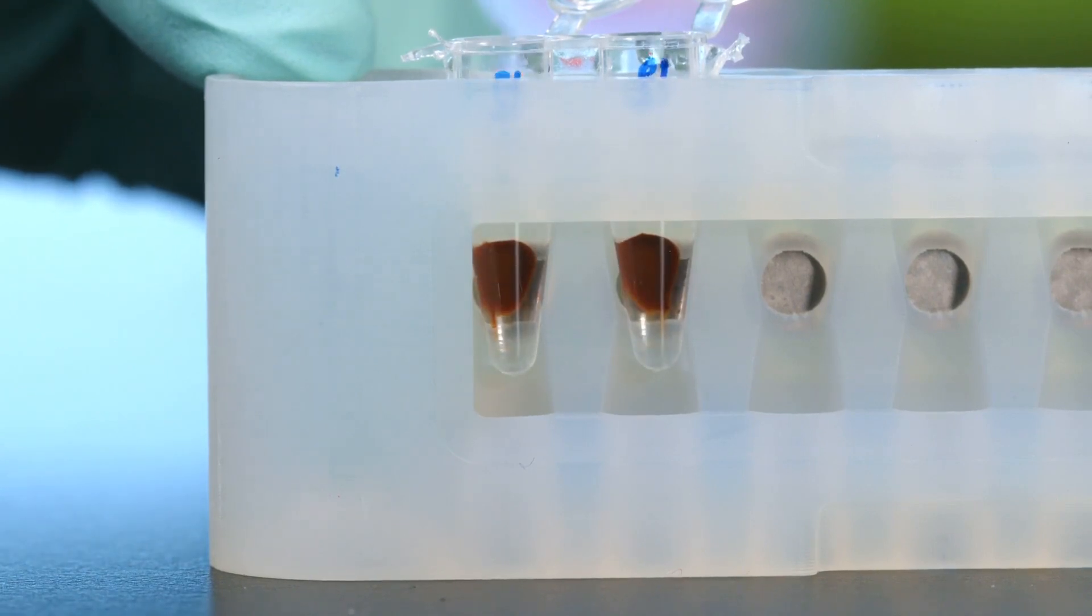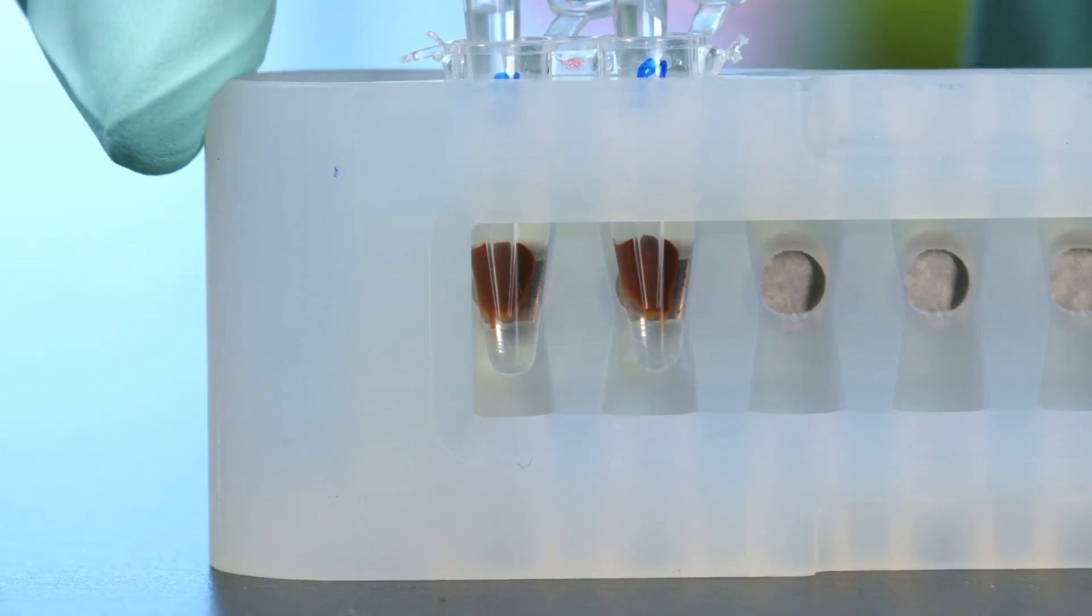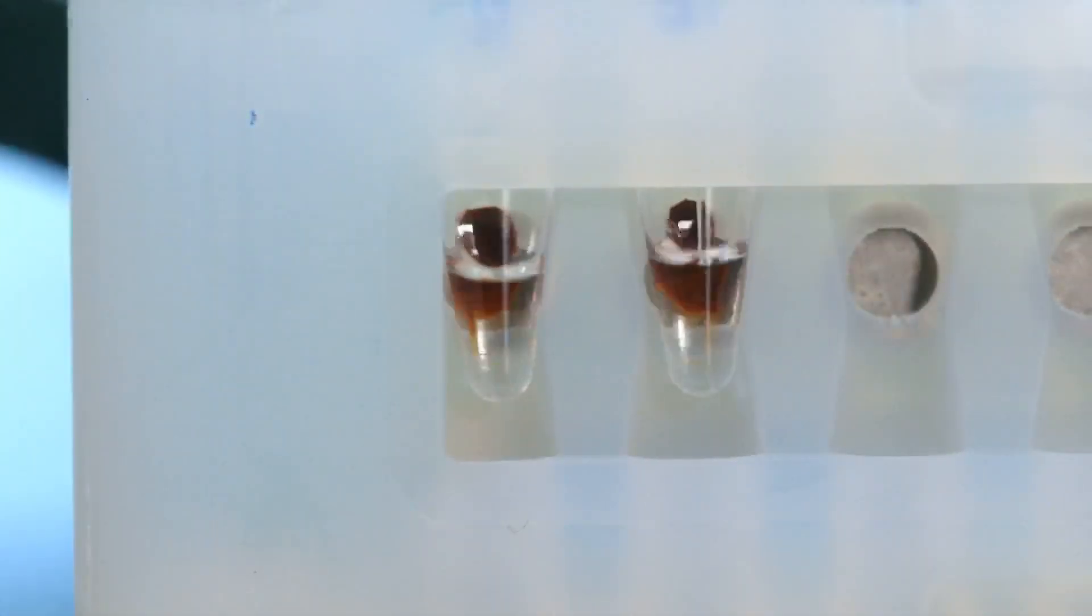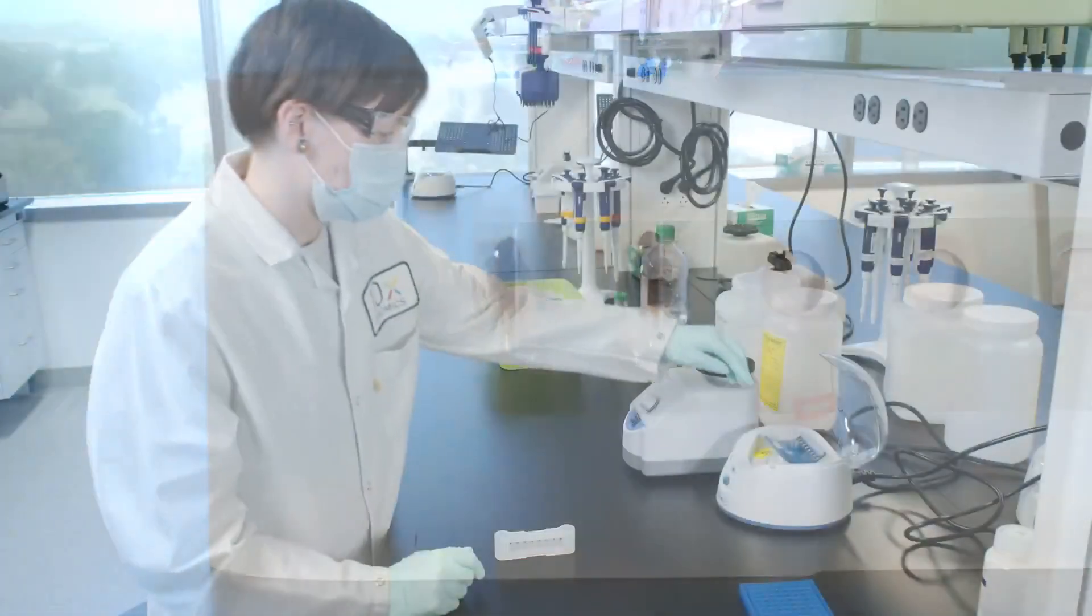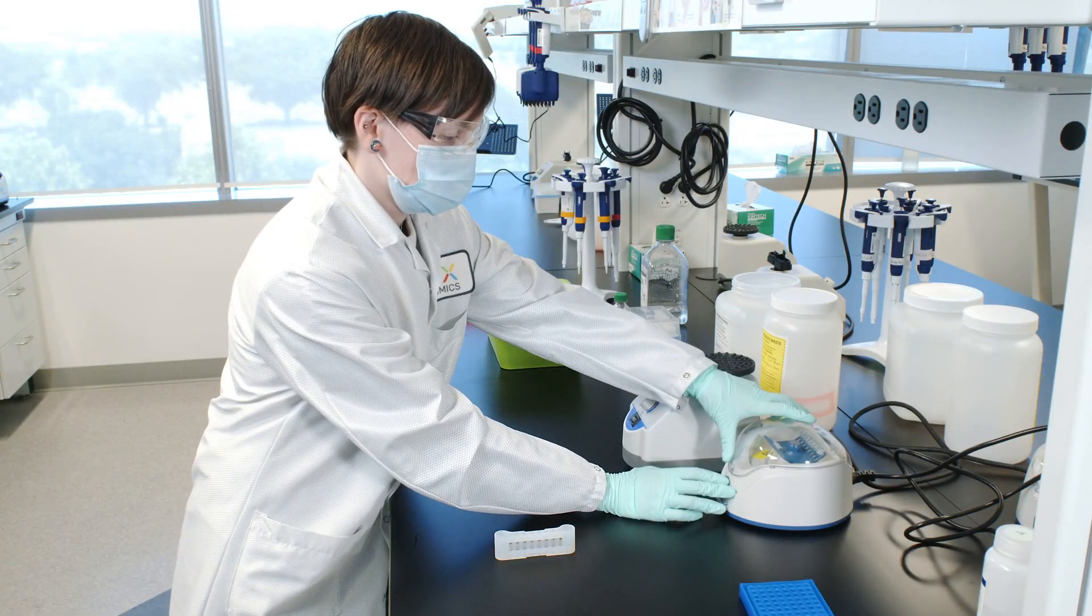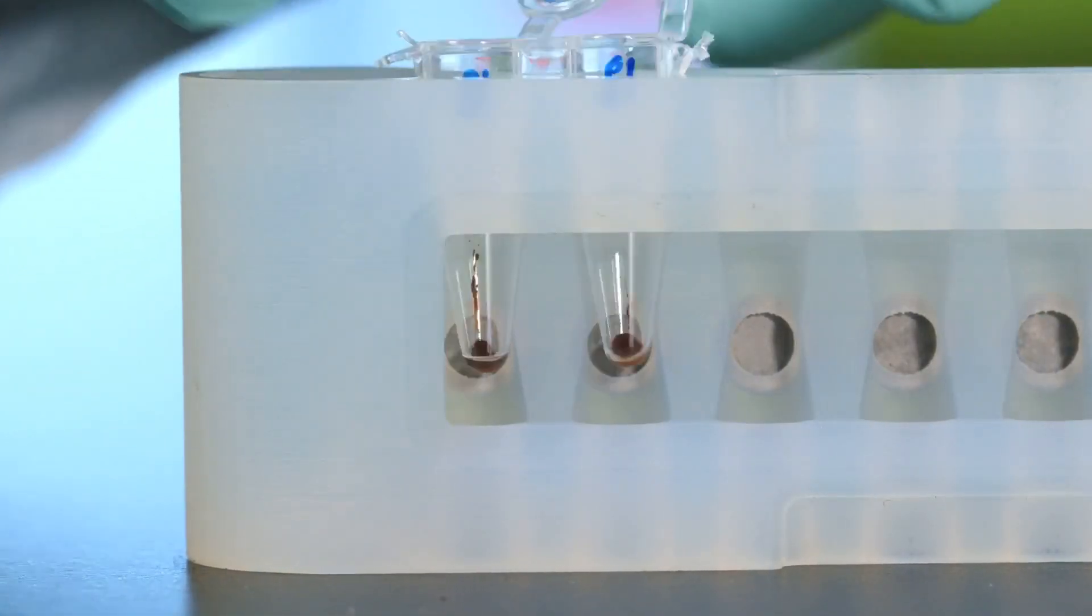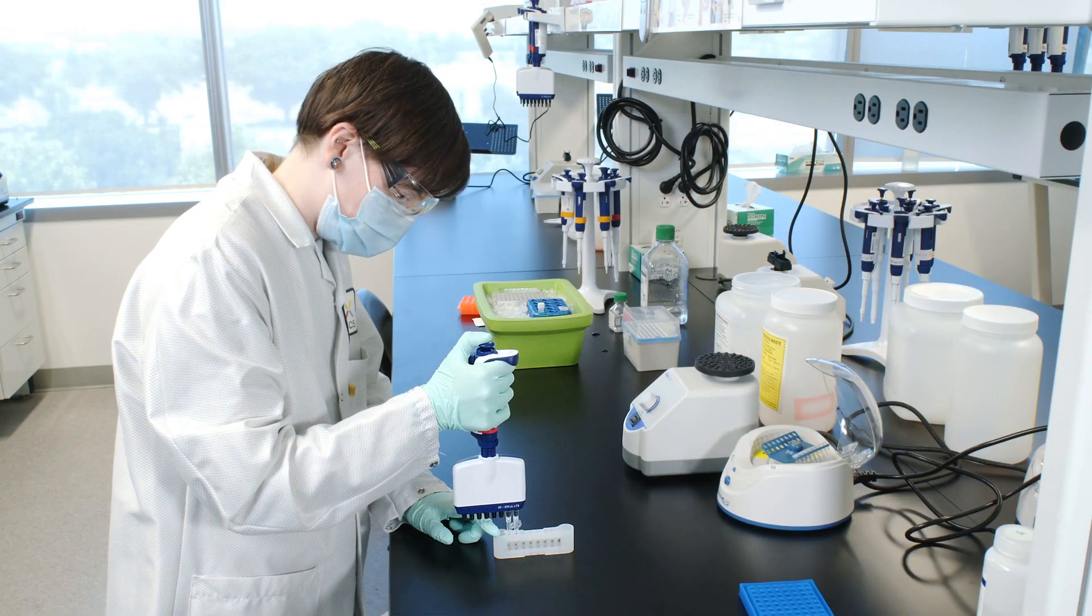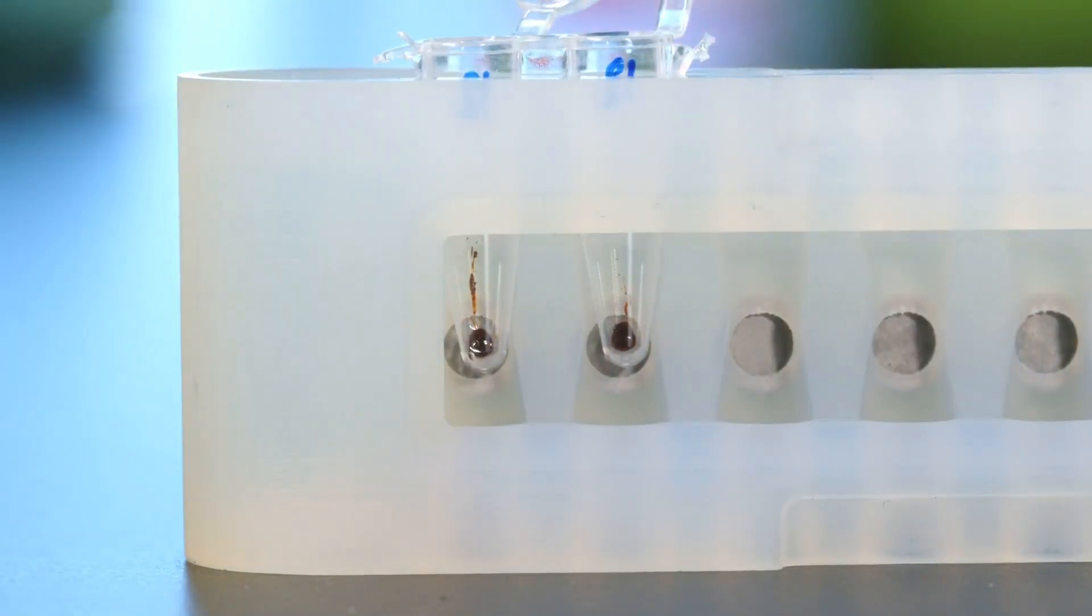Wait 30 seconds, then remove the ethanol. Repeat for a total of two washes. Centrifuge briefly, place on the magnet in the low position, and remove any remaining ethanol. Air dry for 2 minutes. Do not exceed 2 minutes as this will decrease elution efficiency.